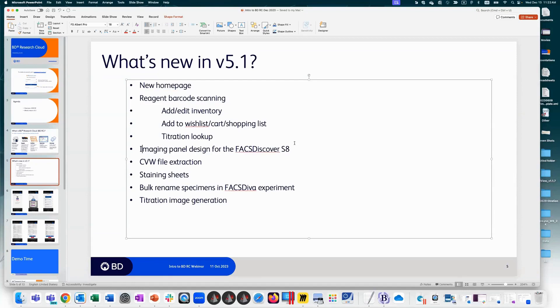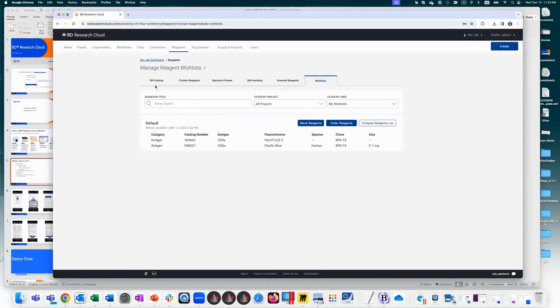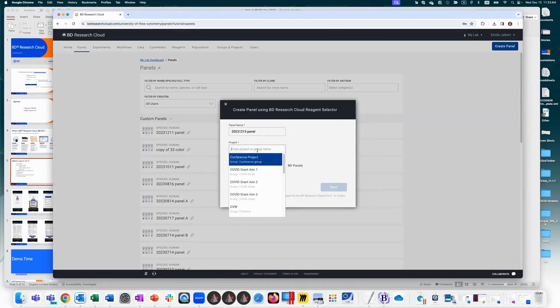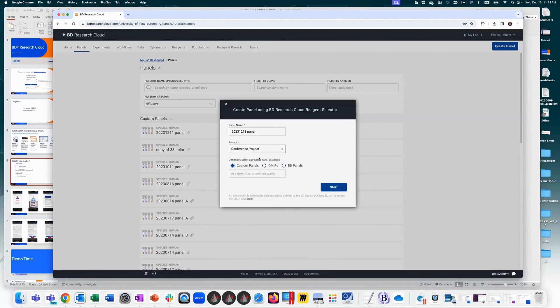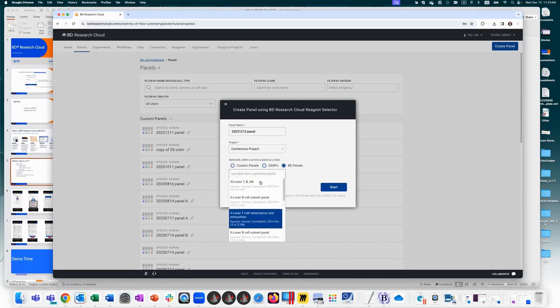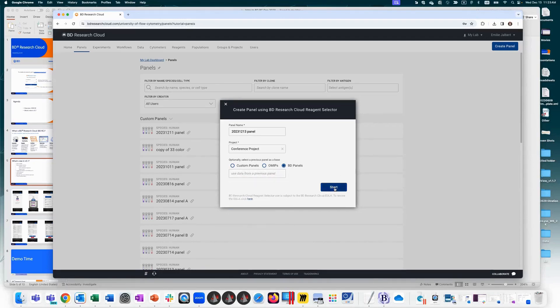Now let's jump into imaging panel design for the S8. Go to panels and create a panel — give it a name, assign it to a project. You can start a panel from scratch or from a previous one, selecting from custom panels in your organization, OMIPs, or BD panels as a base.